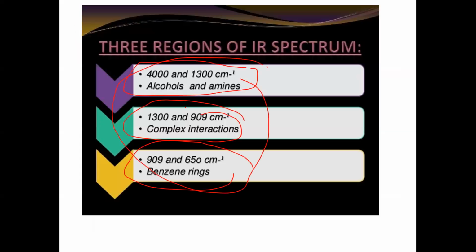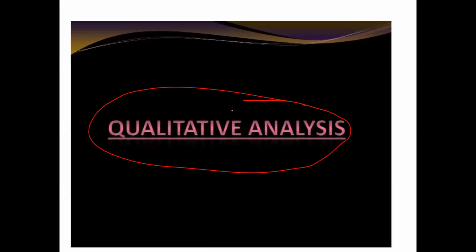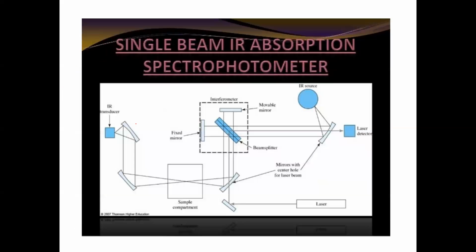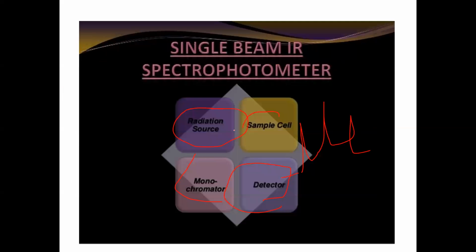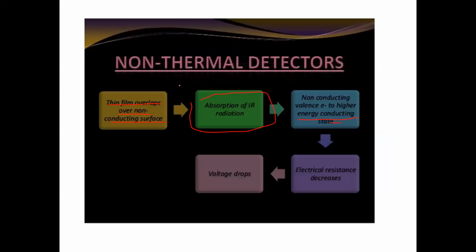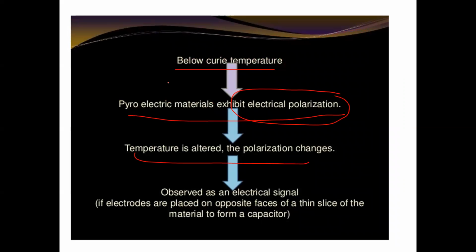Thank you. And at the end of this lecture, we ask you to please neglect these detectors, because I did not explain them very clearly. This one means the single beam spectrometer and like that. Okay, so it is not very important for you now. You will only concentrate on the IR spectrometer, meaning which types of parts are used in IR spectrometers.